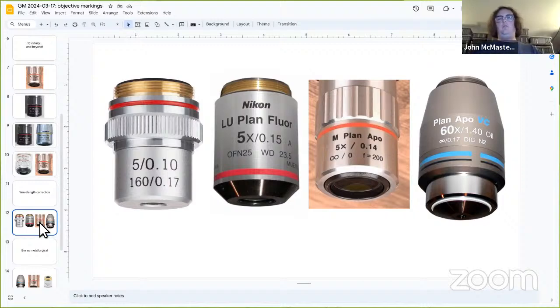And the first really big one I think they started doing was what they call fluorite glasses or something like that. I don't know the exact history, but in the original incarnation of these objectives, it was like fluorite crystals or something like that. Those were able to have some special optical properties that allowed you to pair them up together and do certain lens combinations. And you would be able to get something closer to a, quote, unquote, perfect optical system.